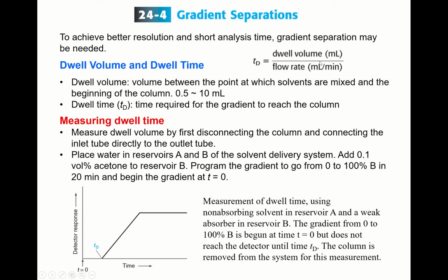Why is the dwell time important? Because if you don't know the dwell time, although you program the gradient elution, that doesn't mean the solvent gradient immediately enters the column, because there is a dwell volume.